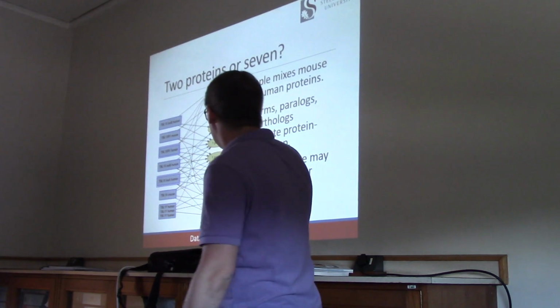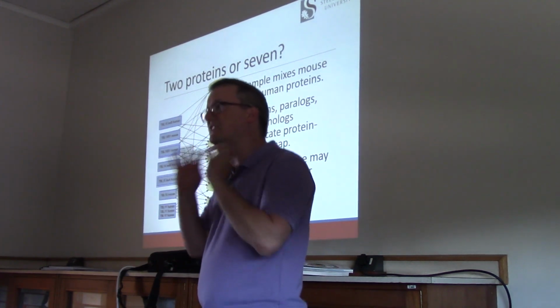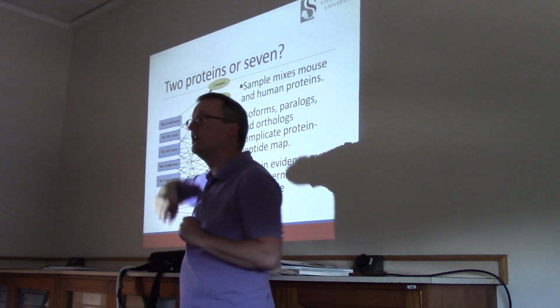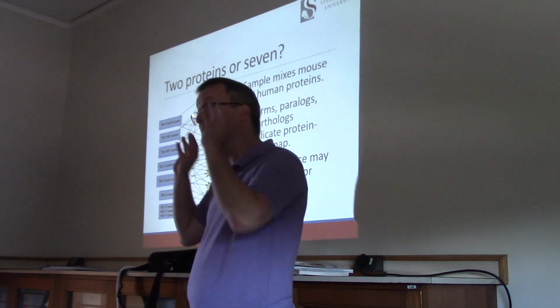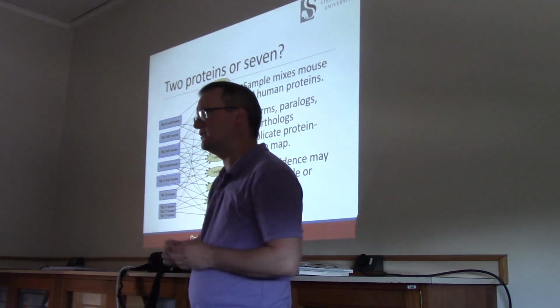All right. So imagine then that these yellow blurbs represent bits of peptide information that we've identified. Now, they're not all equal, right? So we have this second bubble up here that represents 10 different peptides that we identified. But we've simplified the graph. We've done so by grouping together peptides that match to exactly the same sets of proteins.